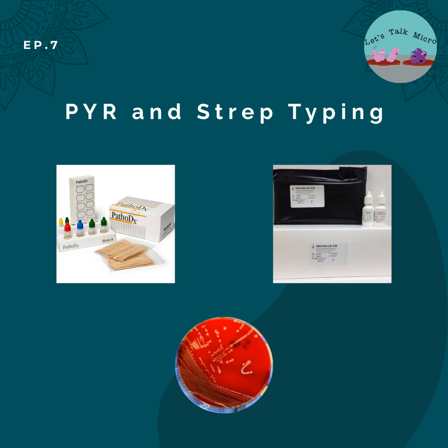Do you remember? Well, by now, if you're looking at the picture of the flow chart that I posted last week, you're doing your catalase, right? So I mentioned catalase positive, you have a staph; catalase negative, gram-positive cocci in chains, you have a strep. So then the next step will be to perform a PYR.